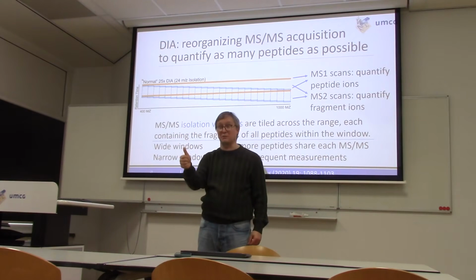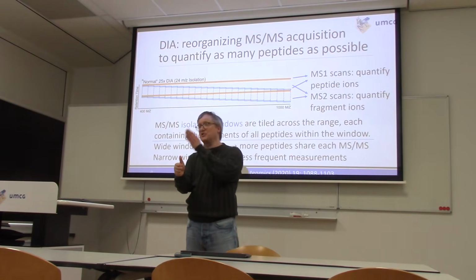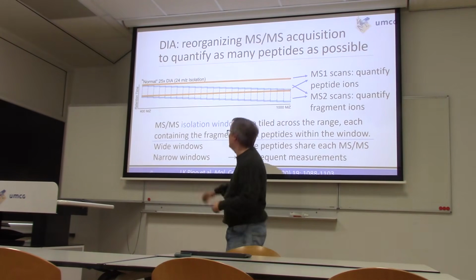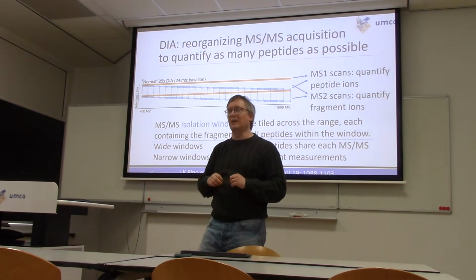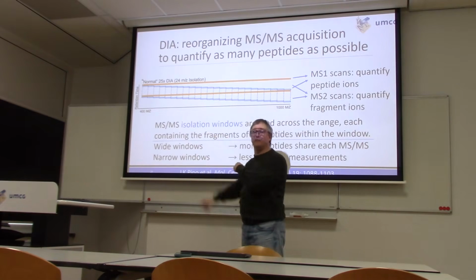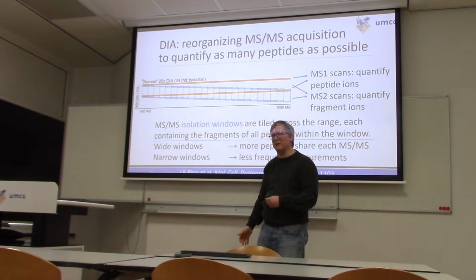If you can measure it every 3 seconds, you might get 10 or 11 slices across its chromatogram and be able to measure both its precursor, the intact peptide in the orange MS scans, and its fragments in these blue scans. Amazingly, bioinformatics people have figured out even how to do identification directly of peptides, even when their fragments are all mixed together with other nearby precursors.